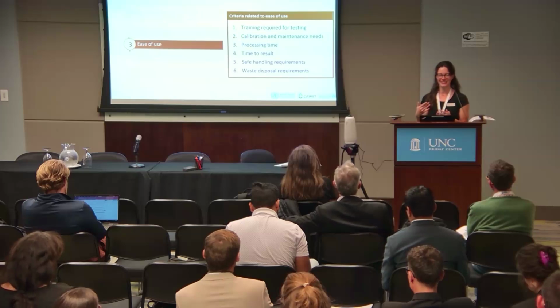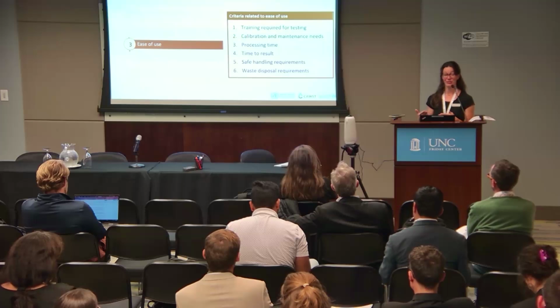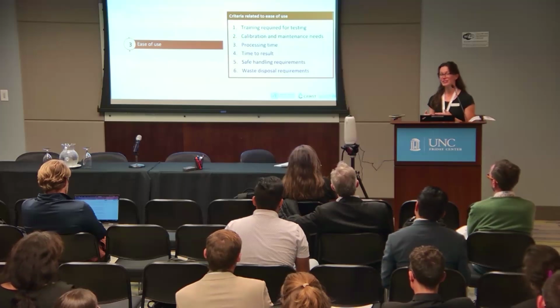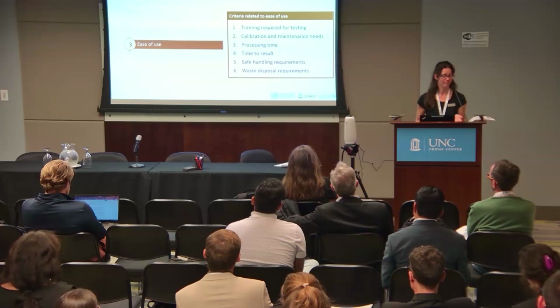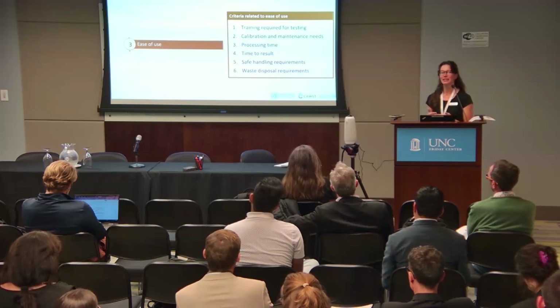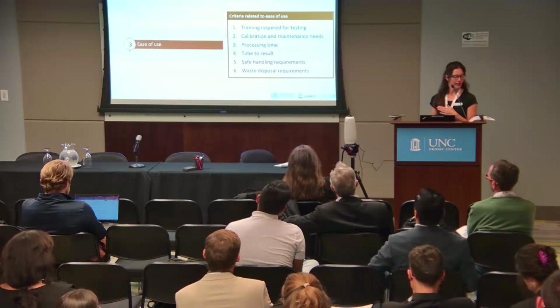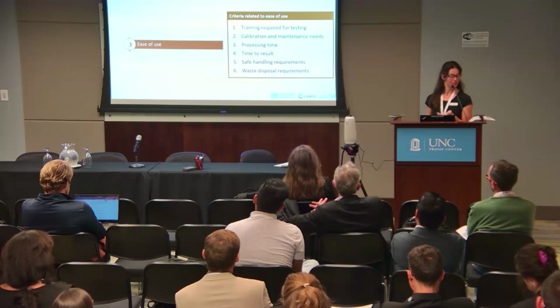So I think somebody mentioned in the session before about disposing of waste, and that can be really challenging, particularly with hazardous or biohazardous waste. So these are just some examples of the criteria that we go into here that might not need to be taken into account everywhere, but should be kept in mind when selecting a method.